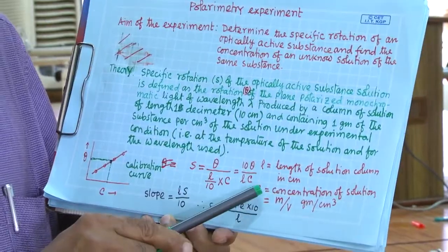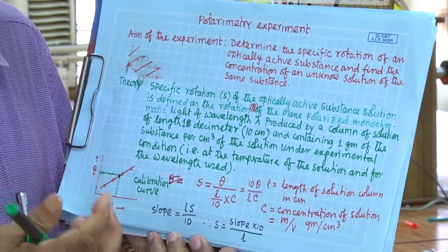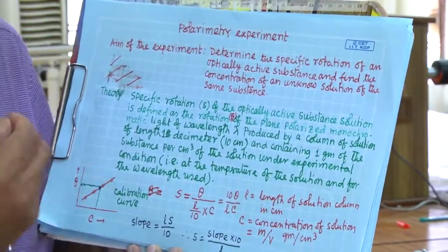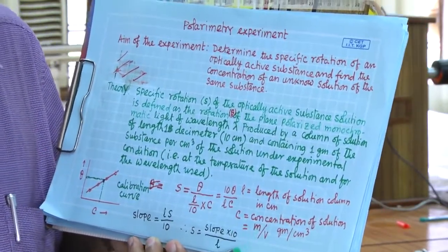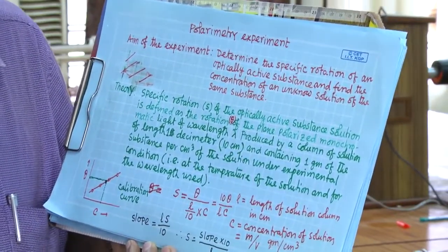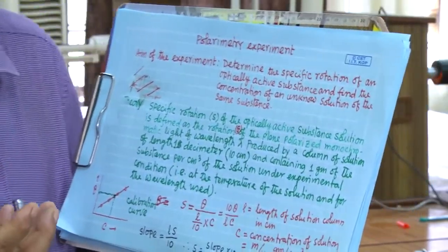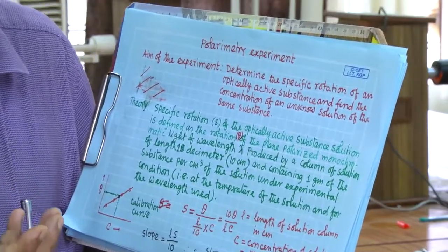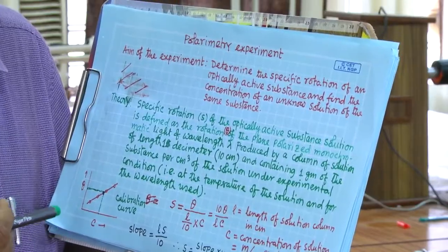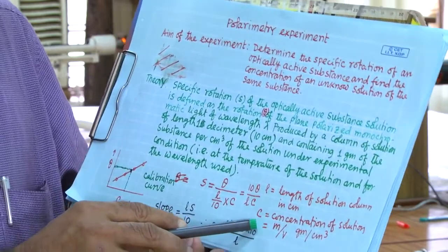Okay. And concentration of the solution is basically m by V. m is the mass of the solute. Okay. Here we will take sugar and then divide by volume. Say if you take some volume, generally we can take 100 cm cube, cc. So, then for 20% concentration, m has to be 20 gram. Okay.